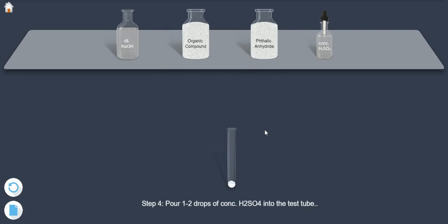Step 4: Pour 1-2 drops of concentrated sulphuric acid into the test tube.